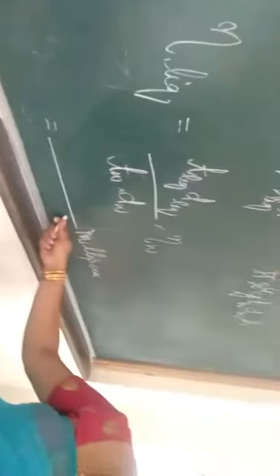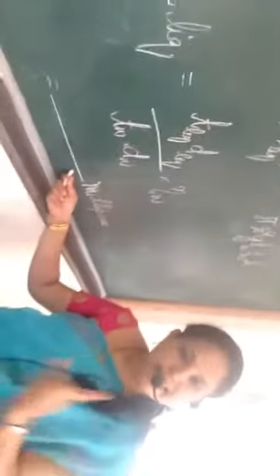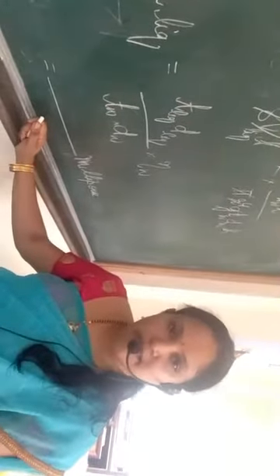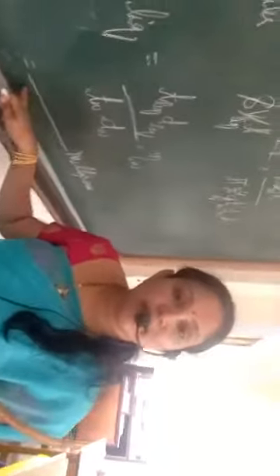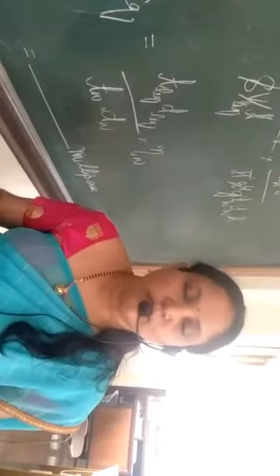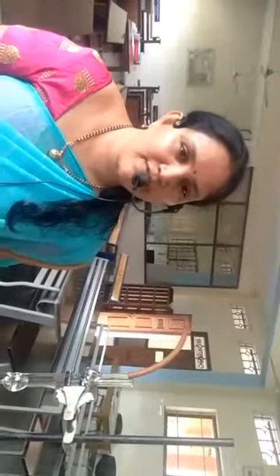Now you will be reporting some viscosity for us, and the exact viscosity for that temperature is also a constant. So by finding out how much your reported viscosity value differs from the correct value, you will be awarded marks. Now we have found out the viscosity of the given liquid.